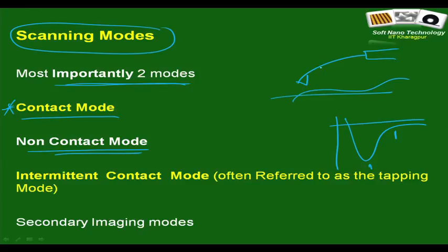extremely poor, and non-contact mode imaging is used, but in conjunction with contact mode, typically for extracting certain additional interactions like electrical force microscopy or magnetic force microscopy. In electrical force microscopy, the scaling or the decay characteristics of the Coulombic force and the van der Waals forces are known to be different. Therefore, you generate different types of topographies from contact mode and non-contact mode, and you subtract them to identify the electrically active or magnetically active domains. Of course, MFM requires a cantilever coated with a magnetic material.